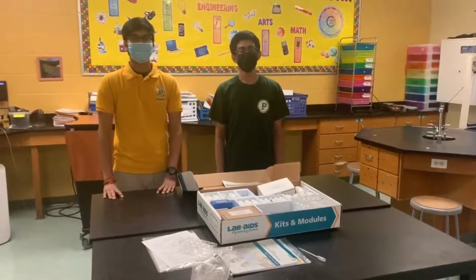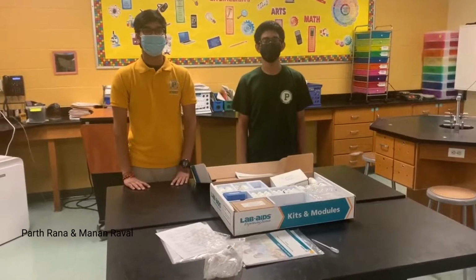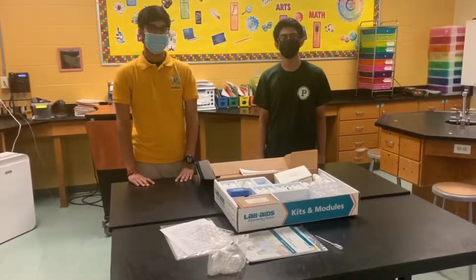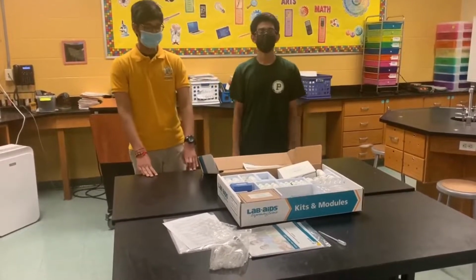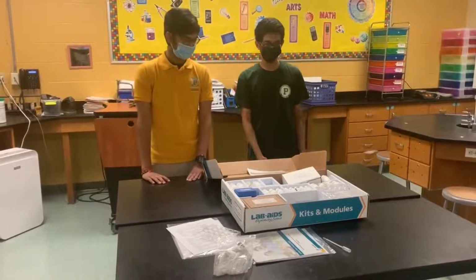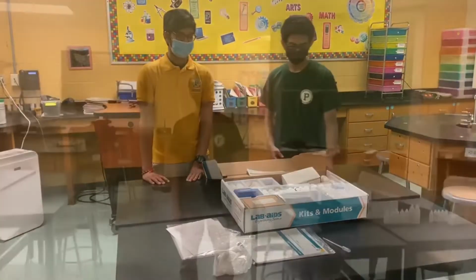Hi, my name is Manan Raval. Hi, my name is Bartholomew. We are from the Passaic Academy for Science and Engineering here in Passaic, New Jersey. We are both seniors. For the Davidson Fellows Scholarship, we are Team Water Contamination Analysis for the Passaic River. Here we use kit number 19, the qualitative introduction to water pollution.